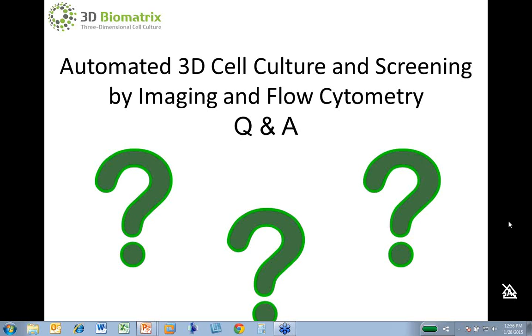Okay, and this question maybe both of you could address, but I'll start with Mike because he went through a protocol. And the question is, are there any protocols for 3D spheroid dissociation and preparation for flow cytometry available? Is the protocol you discussed available, Mike?